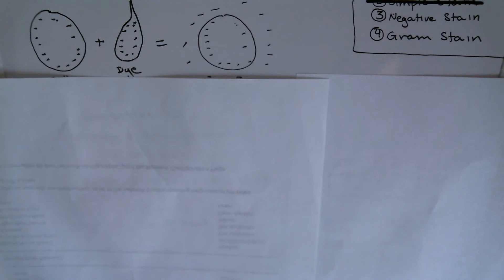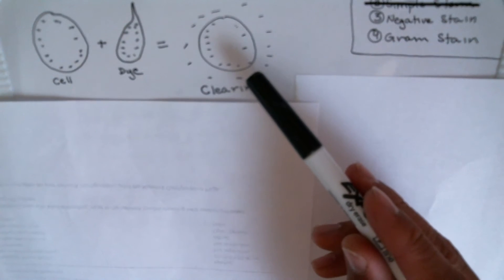The negative stain is kind of opposite to that of the simple stain, in which we have a cell that has a negative charge and we're going to use a dye that also has a negative charge. What we're going to be looking for is a clearing, and that clearing is going to show us the morphology of the cell.